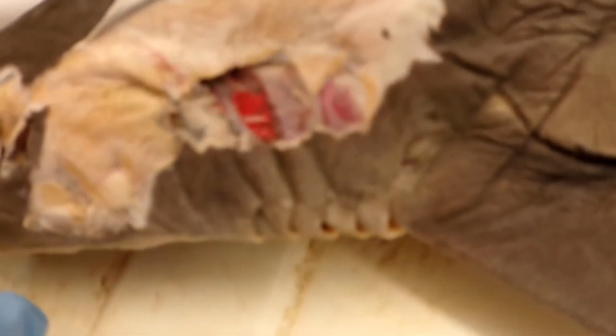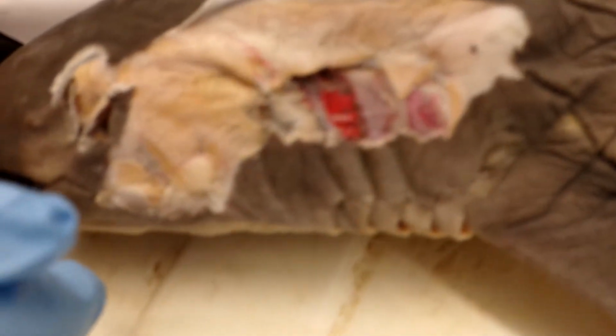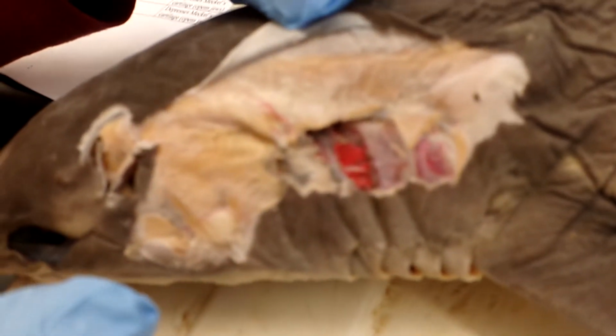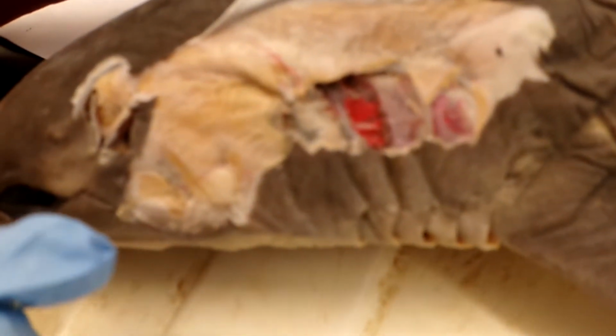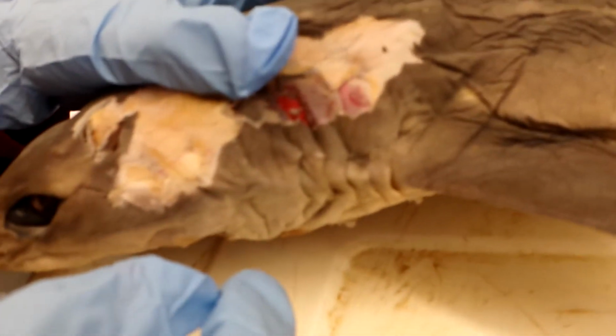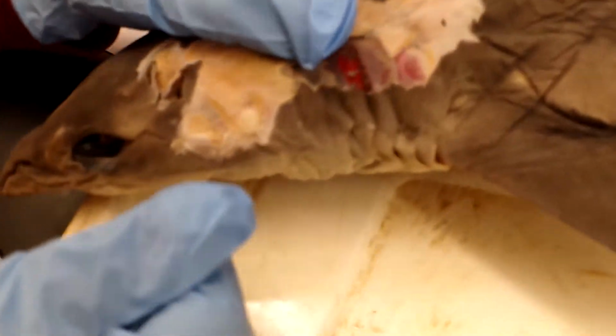And its origin is raphe, insertion raphe, and there was no homologous trait between the two. The next muscle, or the last muscle in this section, is the ventral constrictors, which are found underneath the gills, right here. And its origin is raphe, insertion raphe, and again, there's no homologous trait.